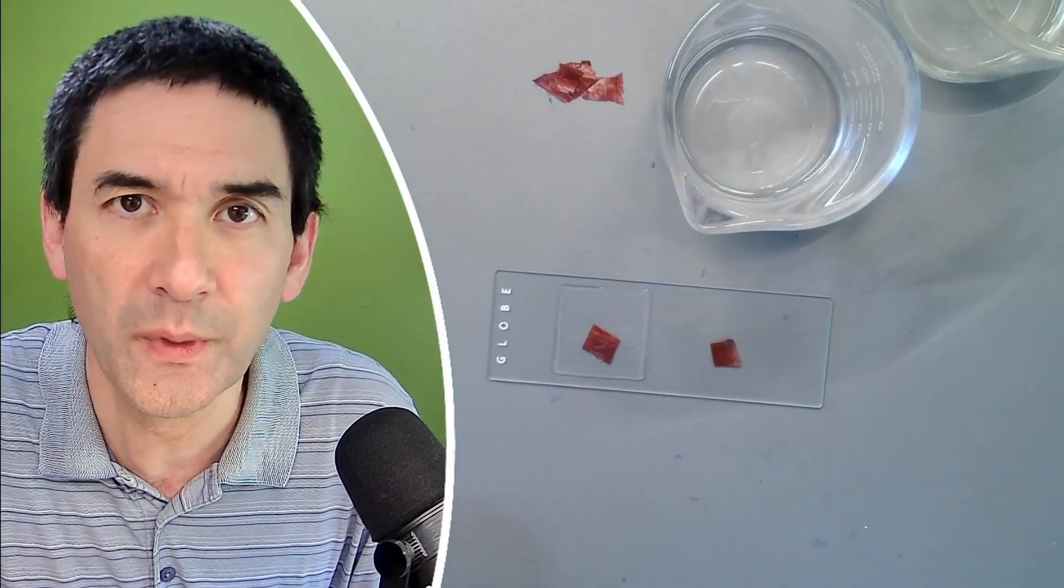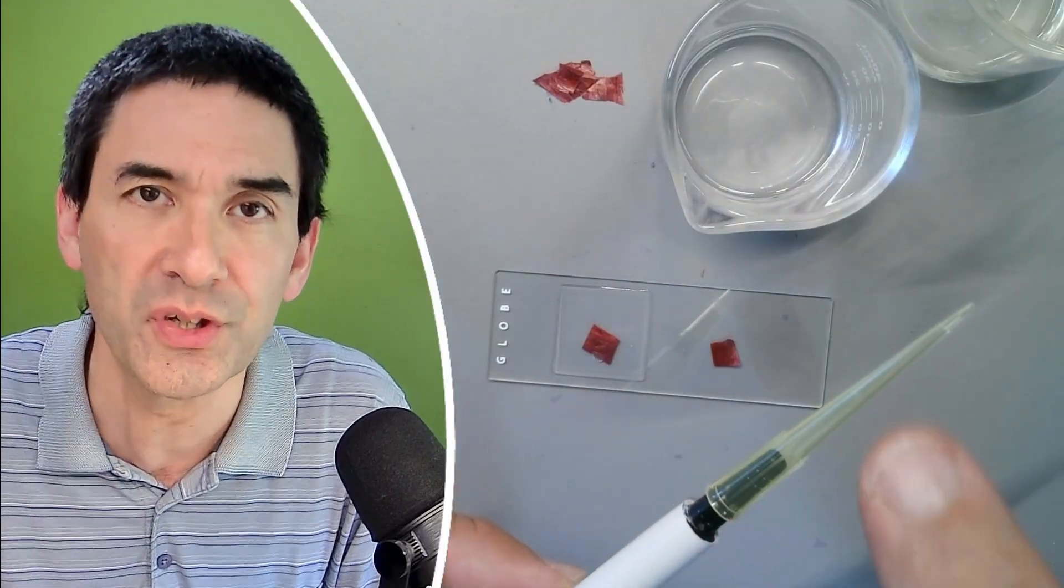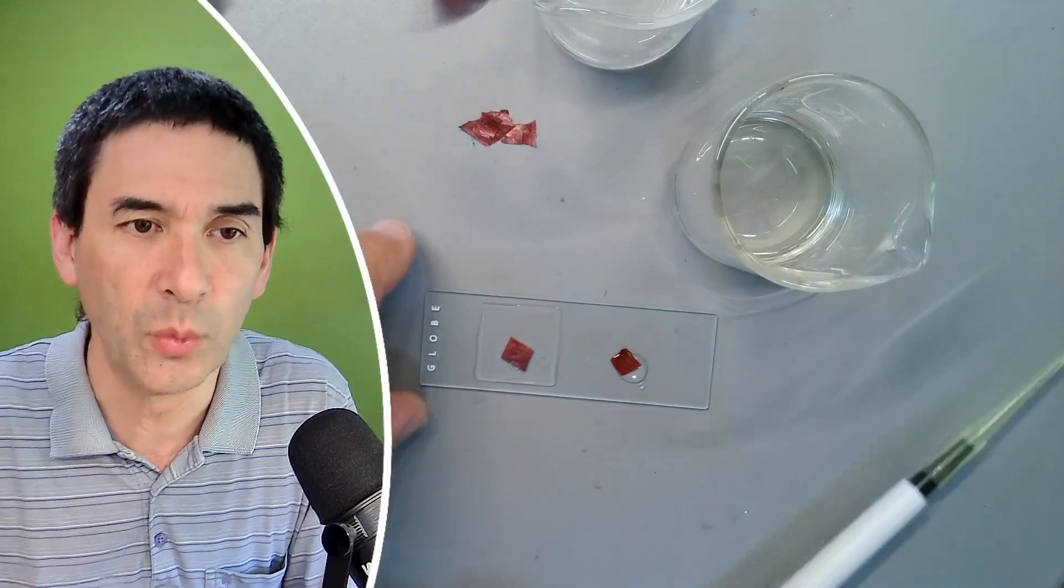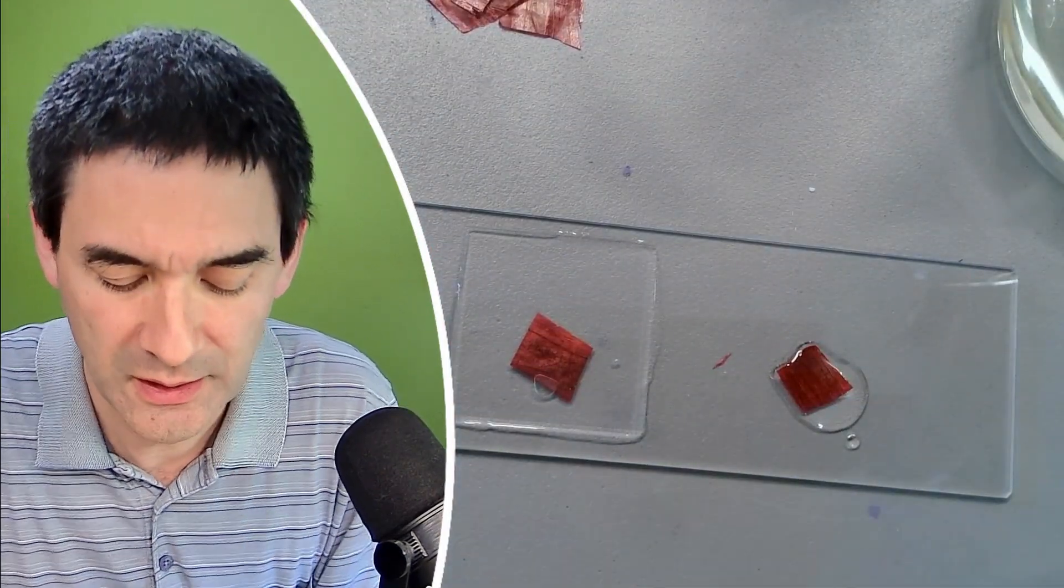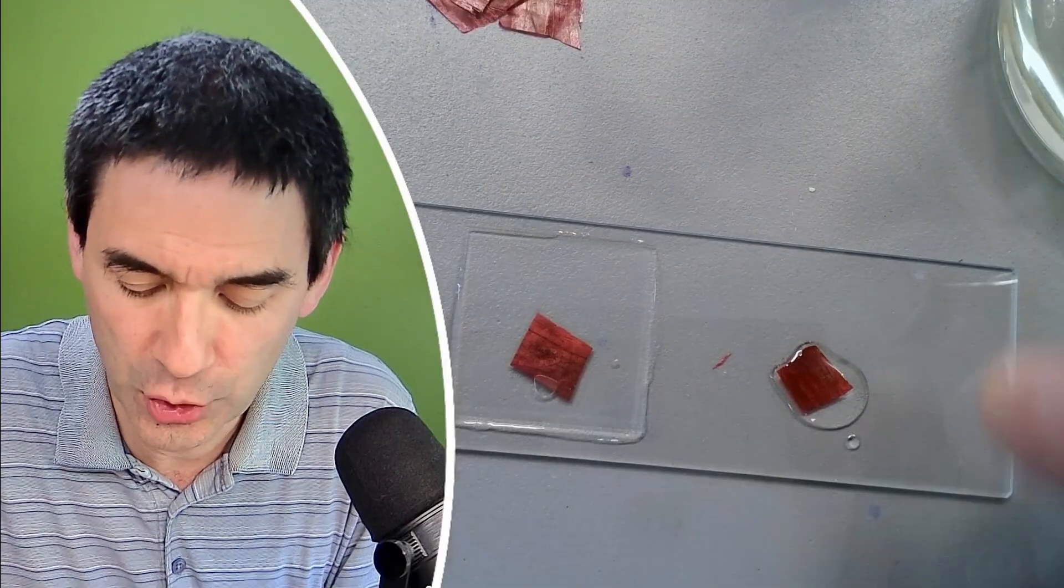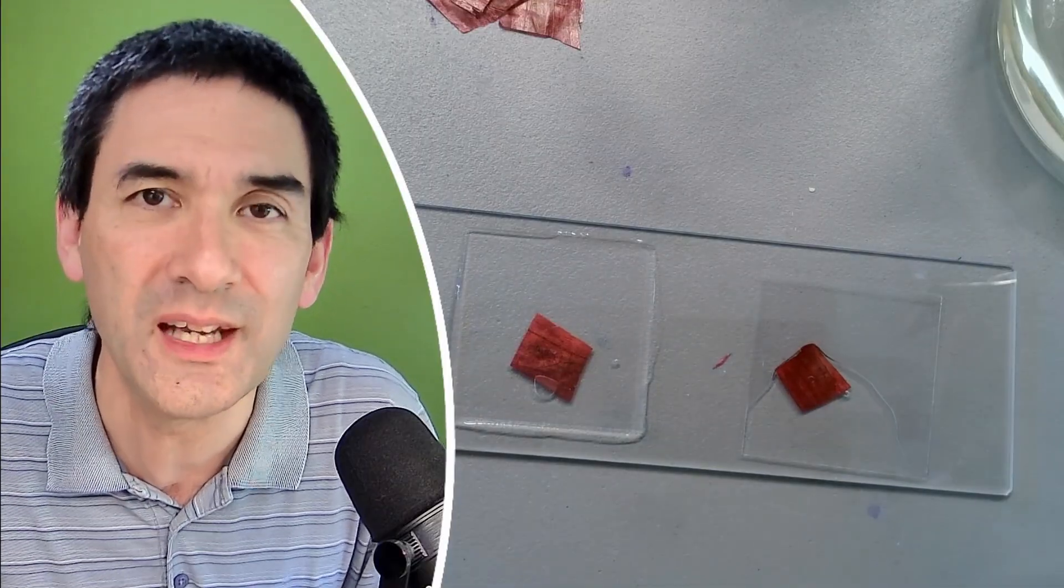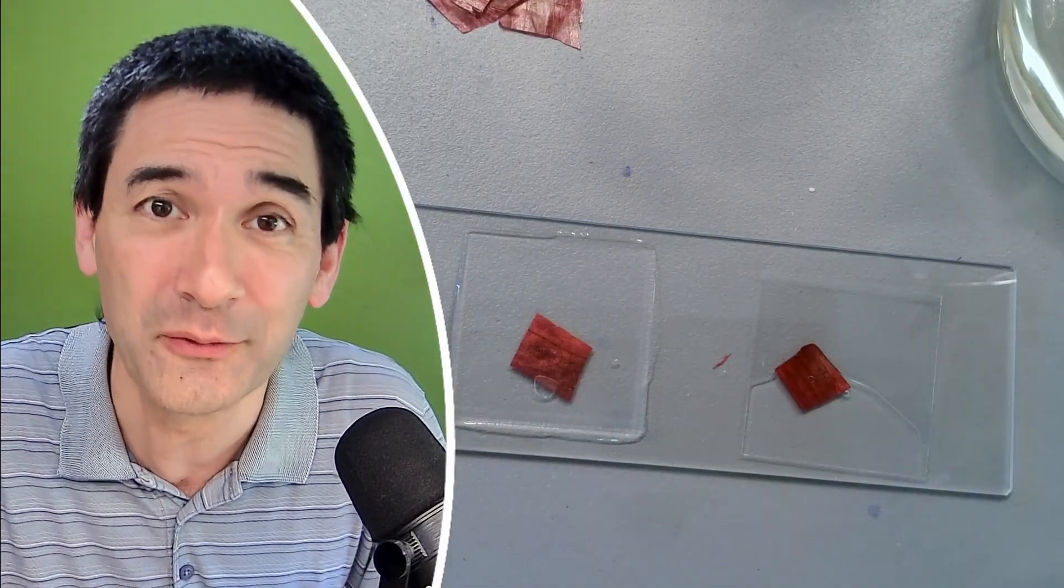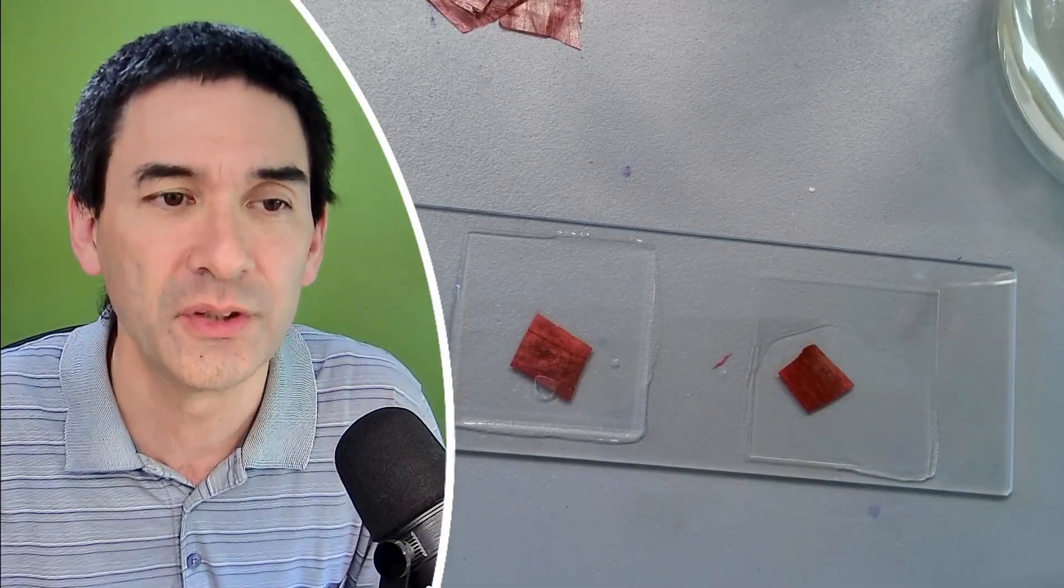And now let's try it with the kitchen oil, the cooking oil. And I'm going to exchange the tip because there is some water in here. So here we go with the oil. You see that the oil likes to spread much better. The oil likes to spread much better and cover glass goes on top in any case. So just make sure that no oil starts to spill out. Otherwise, there's of course always the danger that the oil will then make contact with your microscope objective. And that's something you don't want. But you see, maybe I would just want to press down a little bit more here. Yeah, so now it's nicely spread.